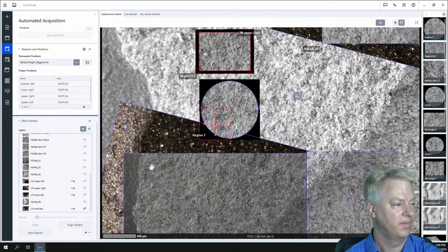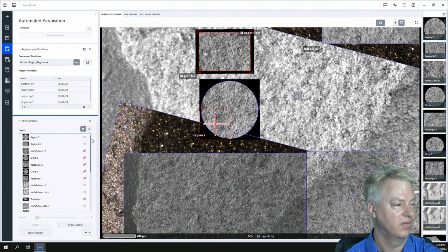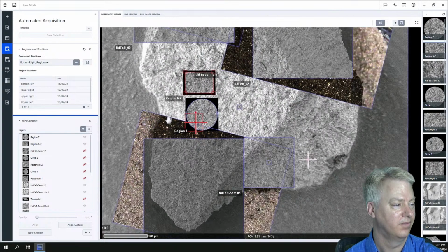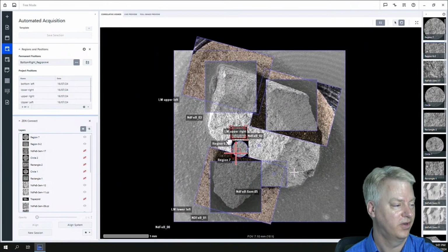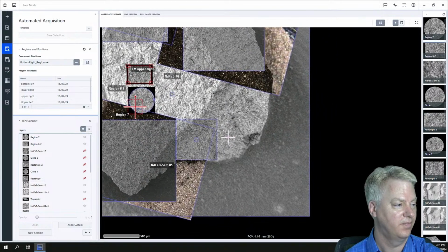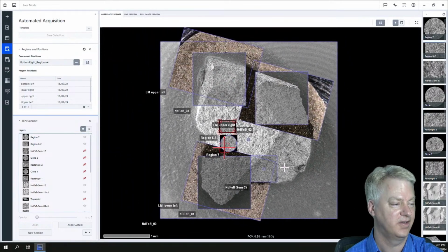If we zoom in here, we see that there's the two different mosaics that are here. You can toggle them on and off to see what was behind it. A lot higher resolution, of course, in the tiled mosaics than there were in the original image. So that's it. That's pretty much all. It's as easy as that.